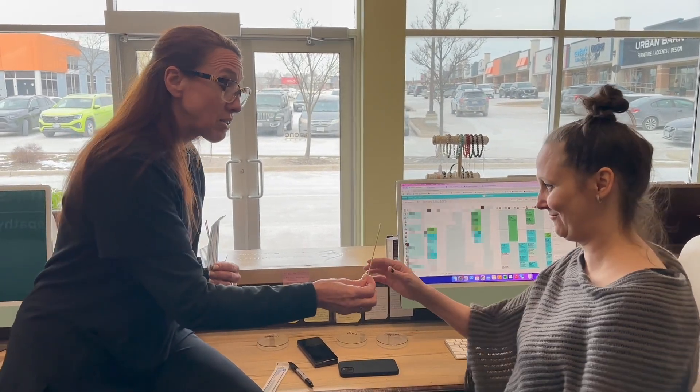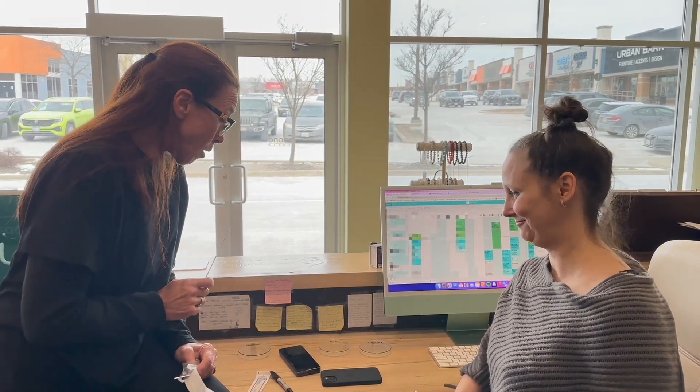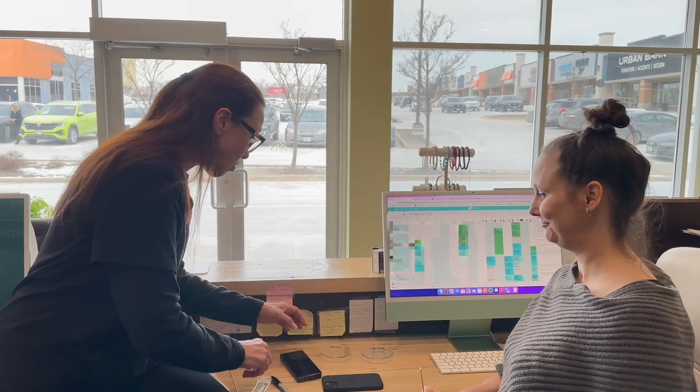Here we are again at our front desk. This is Crystal — you've met her in our other grounding video. So we're going to swab our phones. We have Crystal's phone here and we're going to see what that grows in the next three or four days. We also have Holly, the owner of this practice, and we're going to swab her phone as well. And of course, we're going to swab mine. So let's start with Crystal's.